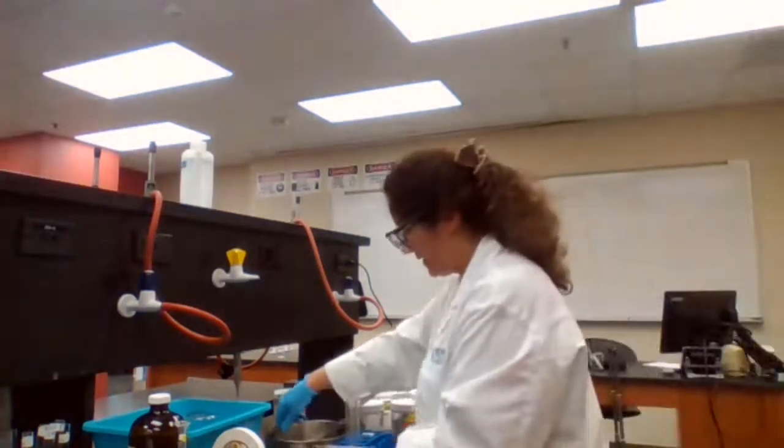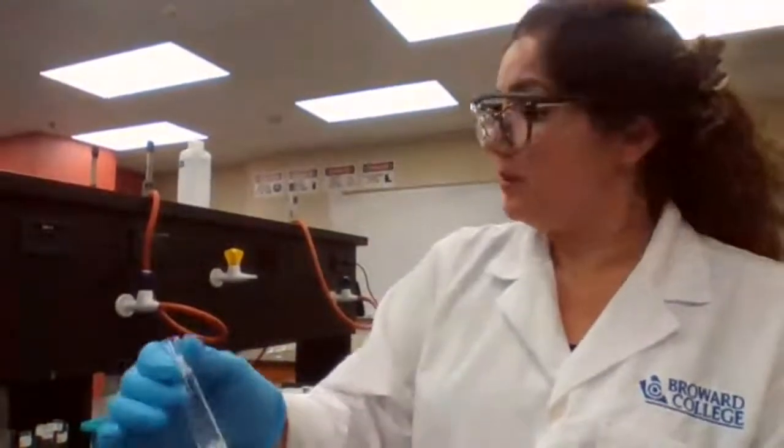I have my chemicals ready for part C of the experiment, waiting for the reaction to finish for part B first. Well, by the time the 0.2 molar HCl dissolves the magnesium, I think it's time for a lunch break, because it's taking a really long time. So we're done with the 0.6. 7.8. I'm going to take these.